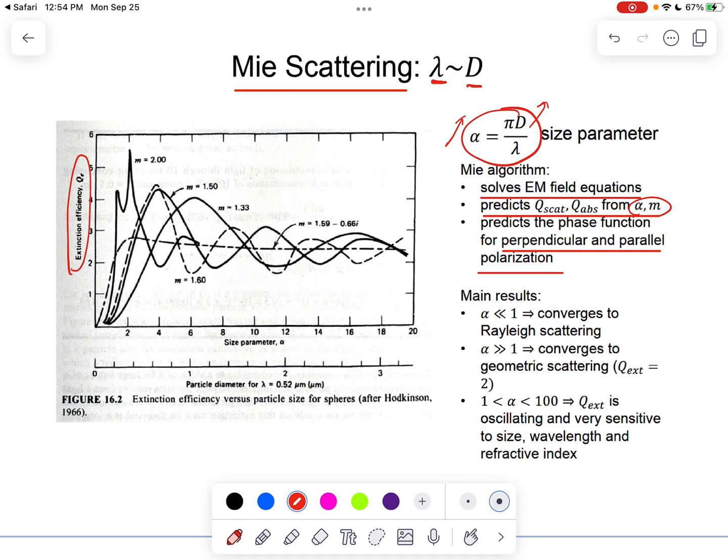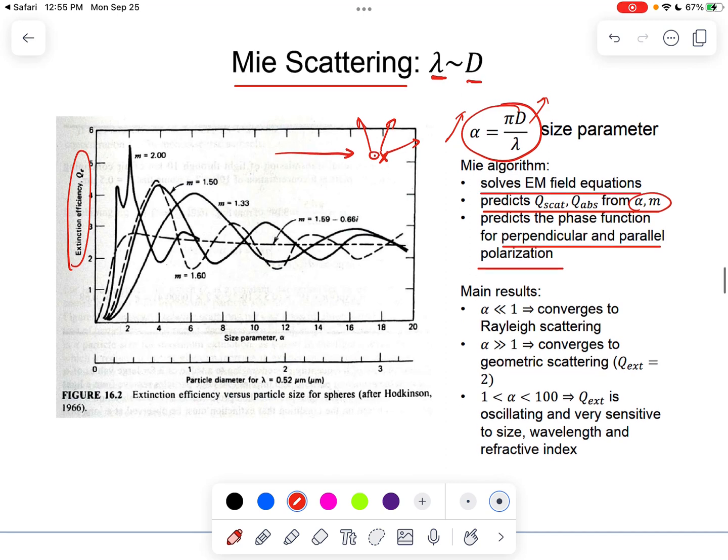So basically, the scattering is happening in all the different directions, right? When the light is directly shining on the particle, there's scattering both parallel to this page here, but also perpendicular to this page here. So there's scattered light going inside, there's scattered light coming outside as well.